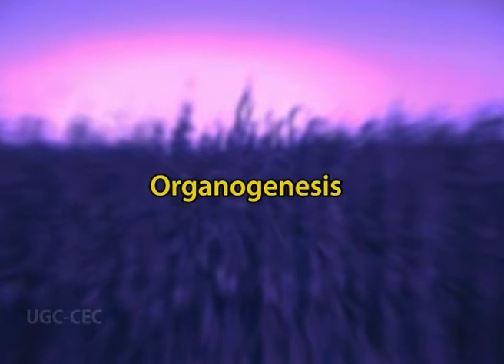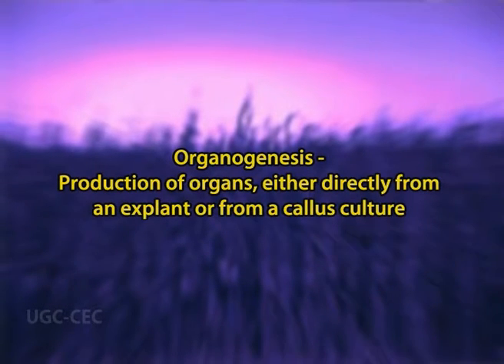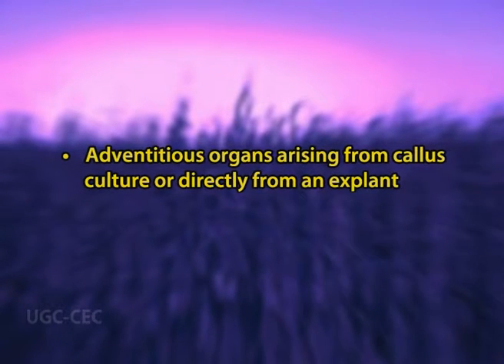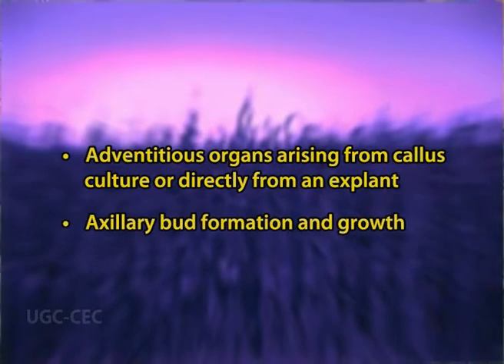Let us first discuss organogenesis. Organogenesis is defined as production of organs either directly from an explant or from a callus culture. There are three methods of plant regeneration via organogenesis. The first two methods depend on adventitious organs arising from callus culture or directly from an explant. The third method is by axillary bud formation and growth.